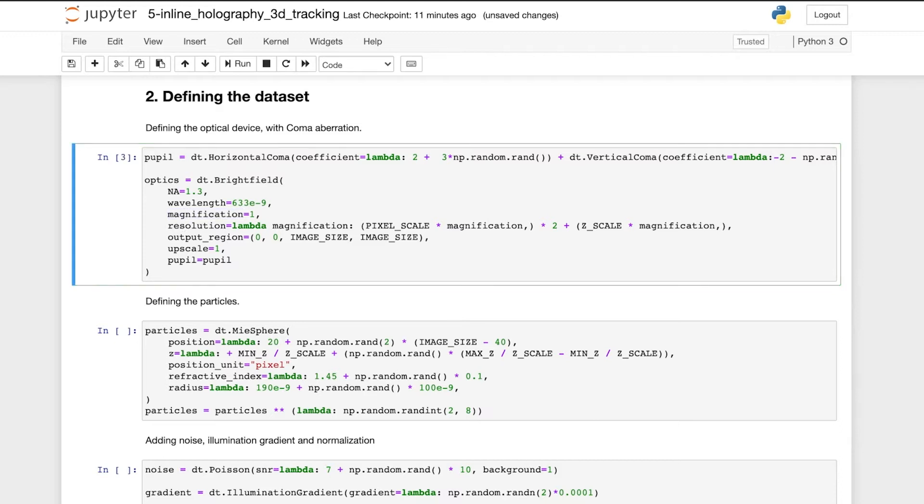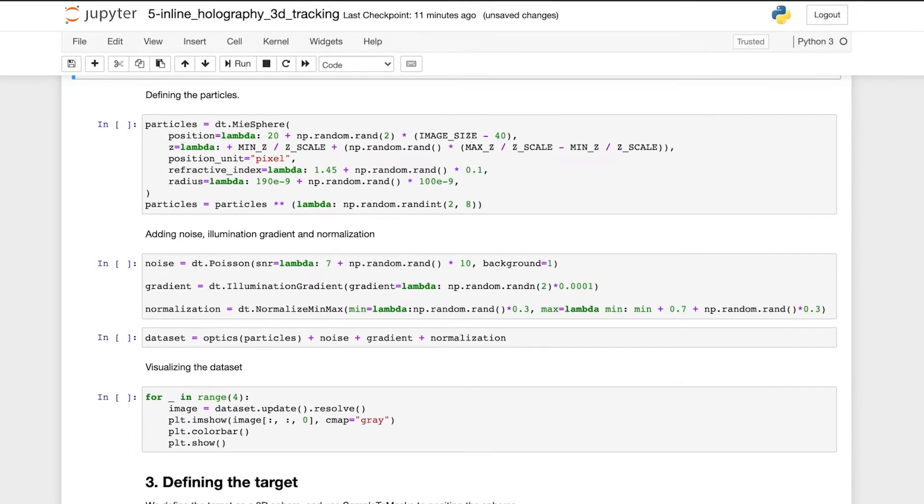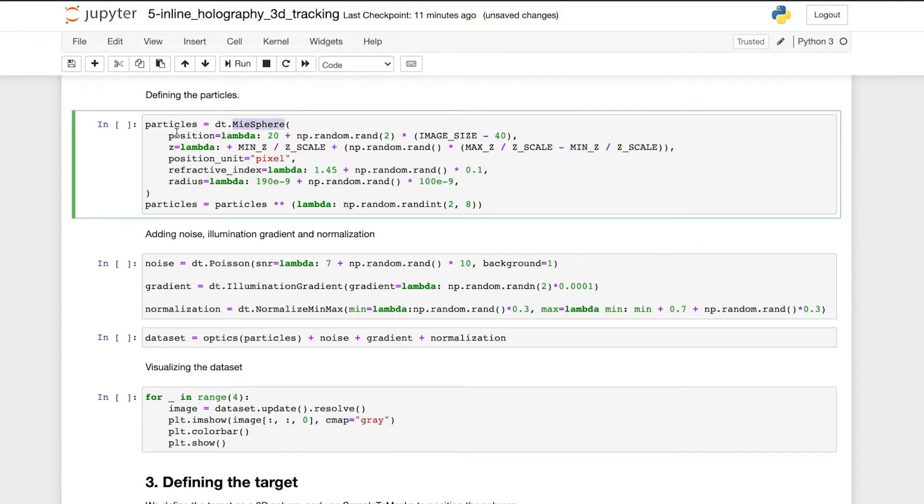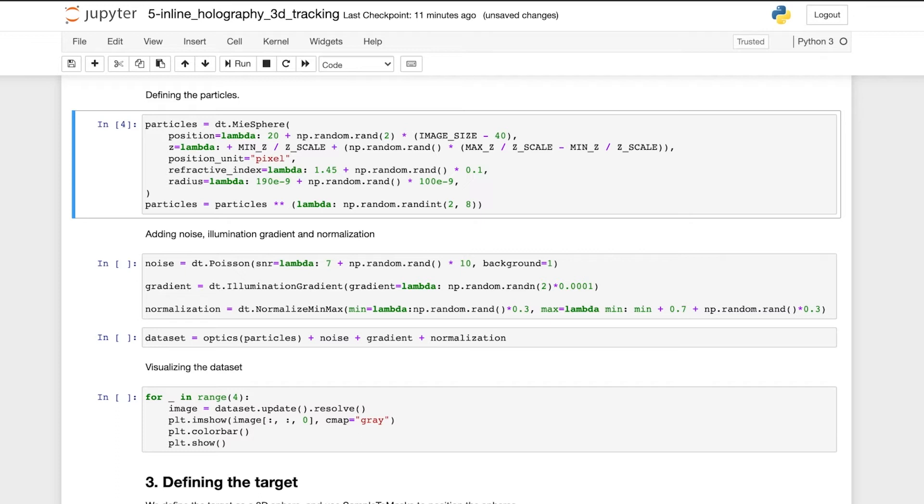The particles are simulated as spheres, and we define their 3D position in pixel units, as well as the particle refractive index and radius. And the number of particles is random between 2 and 8. Each parameter of the simulation is randomly varied around the experimentally expected values, making the network more robust.